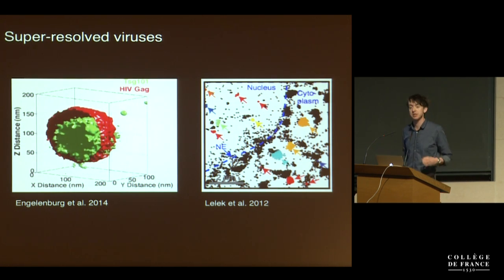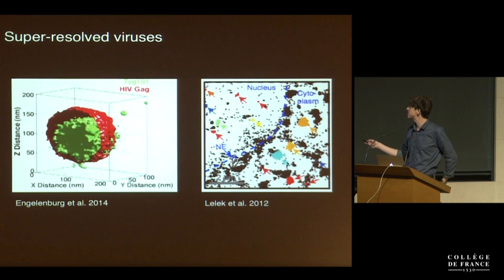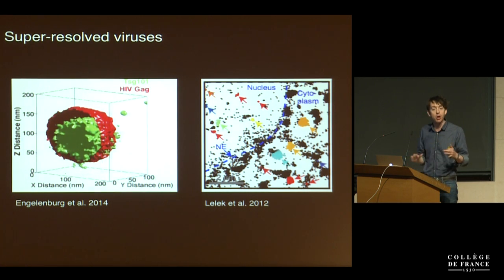This image is taken from a study from the Zimmer lab based at the Institut Pasteur. And they studied the change in size of the HIV capsids as they undergo nuclear import. I want to demonstrate how we're using these techniques, but to do this and to give you a complete story, I'm going to step away from pure virology and talk about the cell biology of the plasma membrane that underpins virus entry.